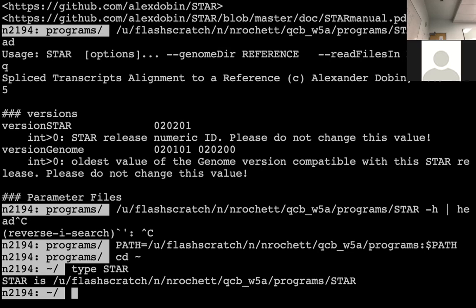So there's an extra space somewhere in your command. One thing I can recommend, especially with these long commands, is to open an unsaved notepad document where you can copy paste things and then edit as you go. The backslashes are necessary on the slides because otherwise everything would be all over the place.